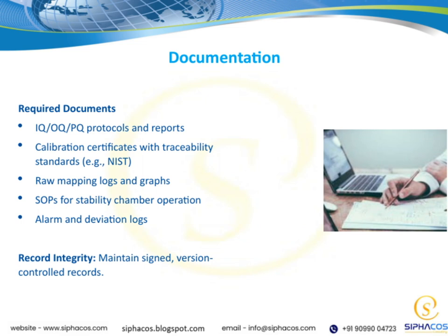Next, calibration certificates with traceability standards, like NIST, are crucial. They verify that our instruments are calibrated correctly and that the calibration is traceable to recognized standards. This ensures the accuracy of our measurements over time.